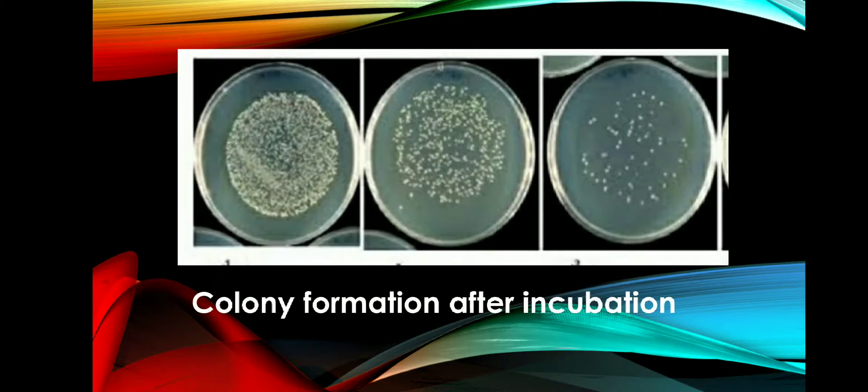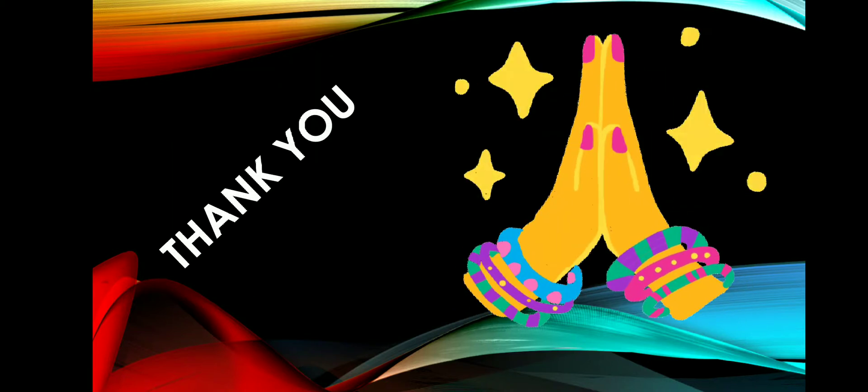These are the plates showing the colony formation after incubation. Thank you for listening.